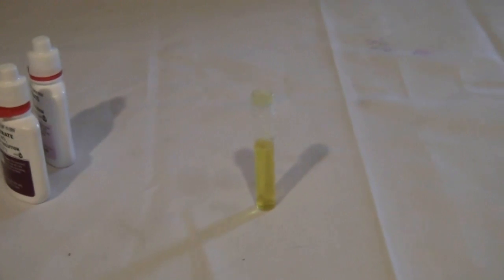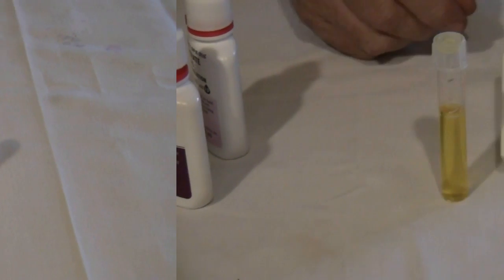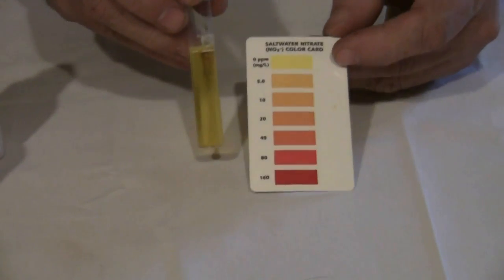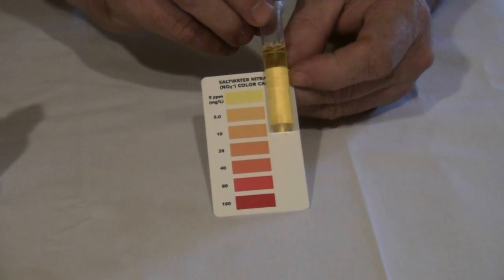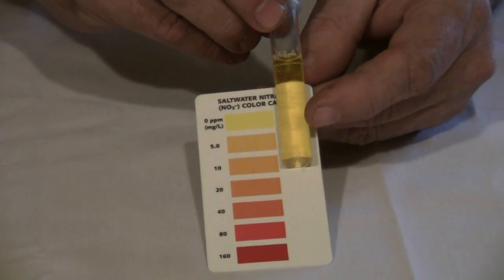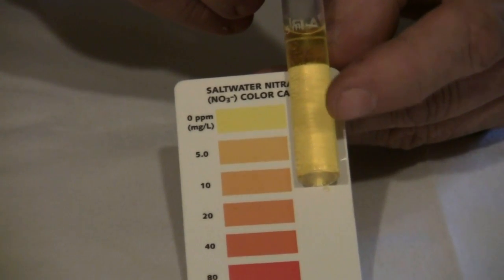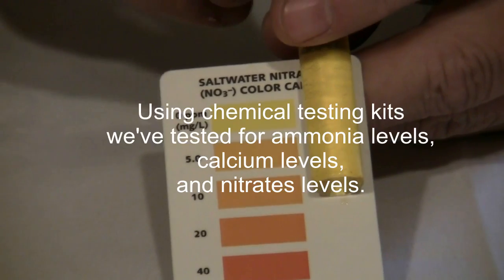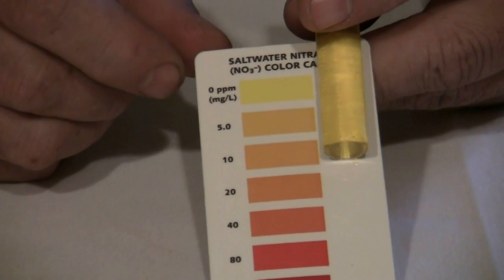We allow it to stand for five minutes to allow the color to develop. It's been five minutes. We now take the vial and compare it to our chart. As we can see, the nitrates are very close to zero — very yellow. Nitrates of five would be an orangish yellow, so we're probably a little over maybe one part per million, very close to zero.